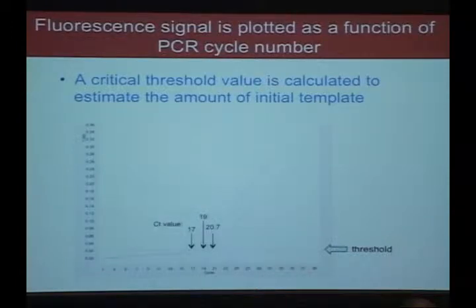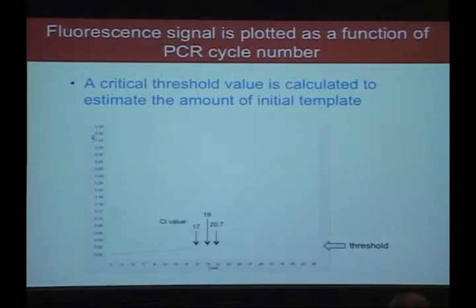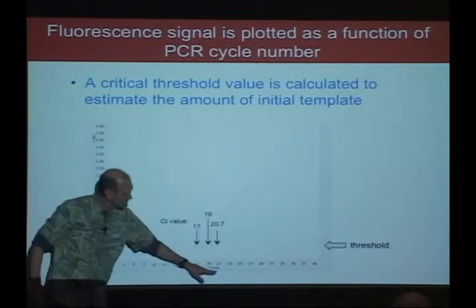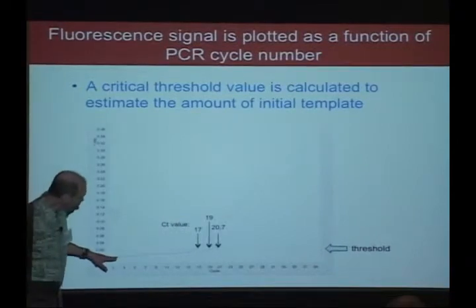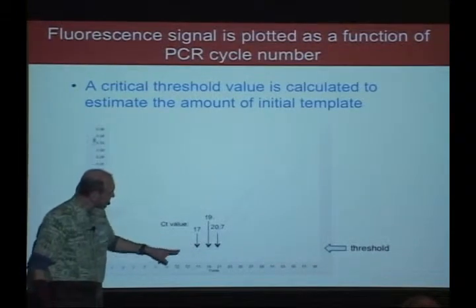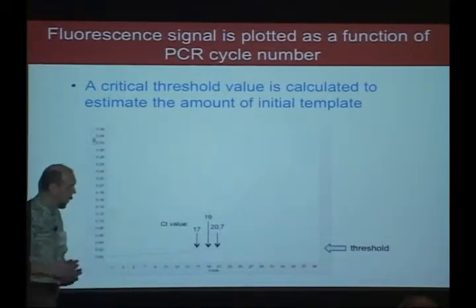And then what happens, of course, is that you have to get to a certain threshold, a certain number of fluorescent molecules that are released in order to be able to see it in a particular well. And then once you get there, you start amplifying that fluorescent signal. And so if you read out the fluorescence as a function of the number of cycles of PCR amplification, of annealing and extension and dissolution again, then you get something that looks like this. You get no fluorescence detected until it reaches some threshold where you start to see the signal, and then it starts to go up, and it's relatively linear, although at some point it eventually saturates.